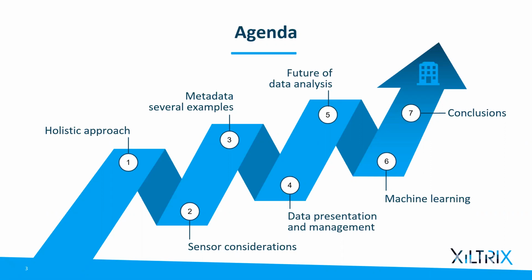We're going to start with a real life example, that holistic approach that we like, and move on to sensor considerations, introducing the concept of metadata, which is very, very important in analyzing data. Then the presentation of data, because if you have a lot of data sources, that doesn't mean you can present them well. If you have too much information, how do you filter that? How do you manage that data? How do you deal with it day to day, month on month?